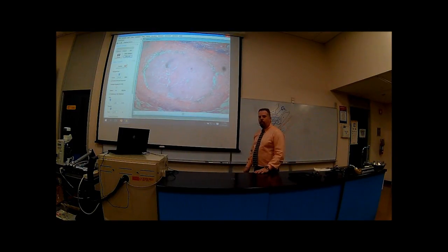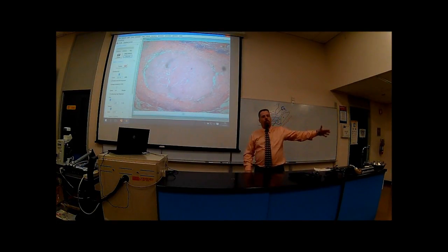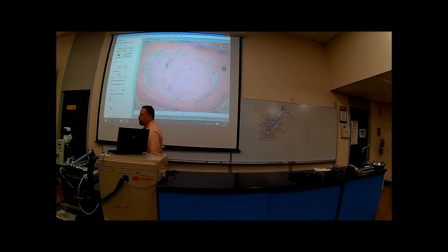That's a tubercle. When the immune system goes down, the bacteria come out of here, realize that the immune system is down, leave this area, and go into the bloodstream, leaving a crater here that bleeds. These people with TB will be coughing up blood, a sign that we call hemoptysis. They cough up blood because you have these big craters of blood coming out. Meanwhile, all the bacteria from the tuberculosis is now disseminating throughout the whole bloodstream, and it goes everywhere. But that's a tubercle. That's a pretty big one shown on there.